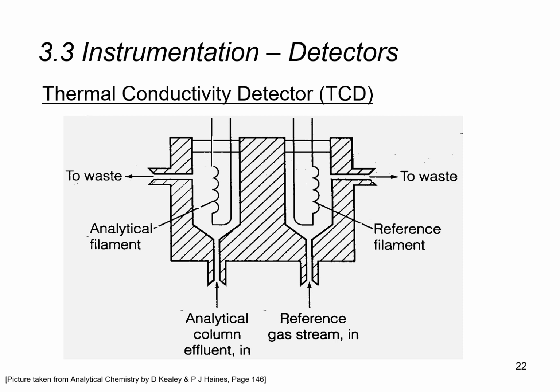The first one we'll be talking about is a thermal conductivity detector, TCD. You'll see that this detector has two chambers, one on the left and one on the right, and it is contained within a heated block that is maintained at a constant temperature. On the right, you see reference gas passing through, and on the left will be the gas from our column. These two chambers are constantly filled with gas, and on the left we see the gas that's passing through from the analytical column, typically nitrogen or helium gas.